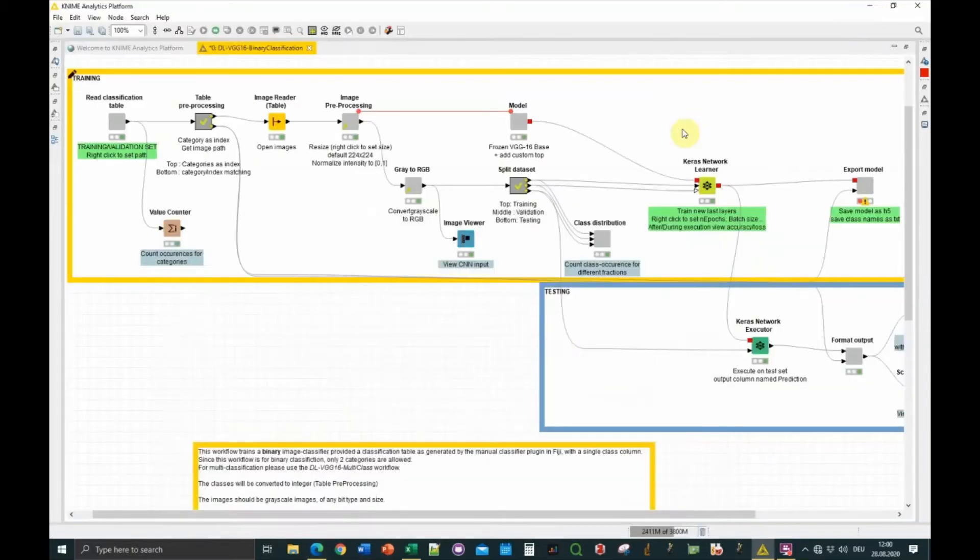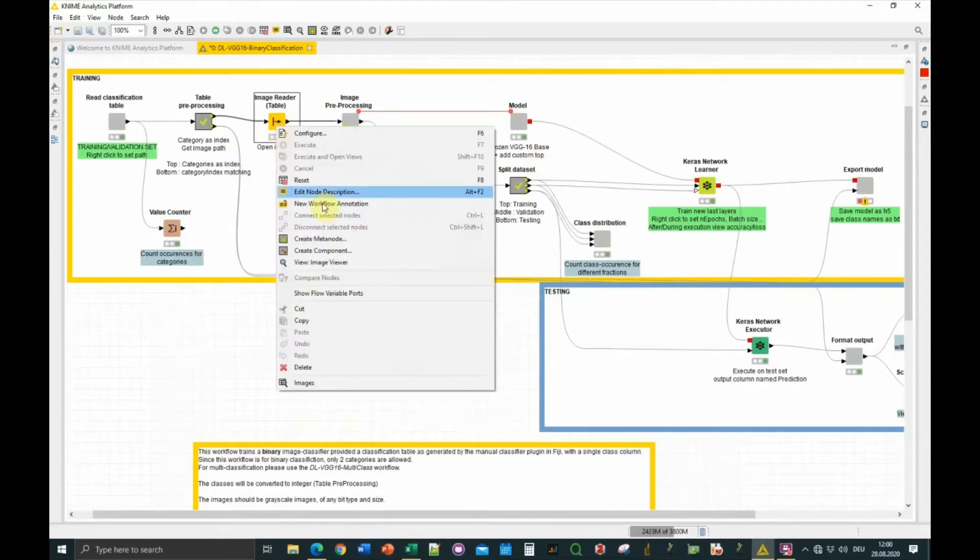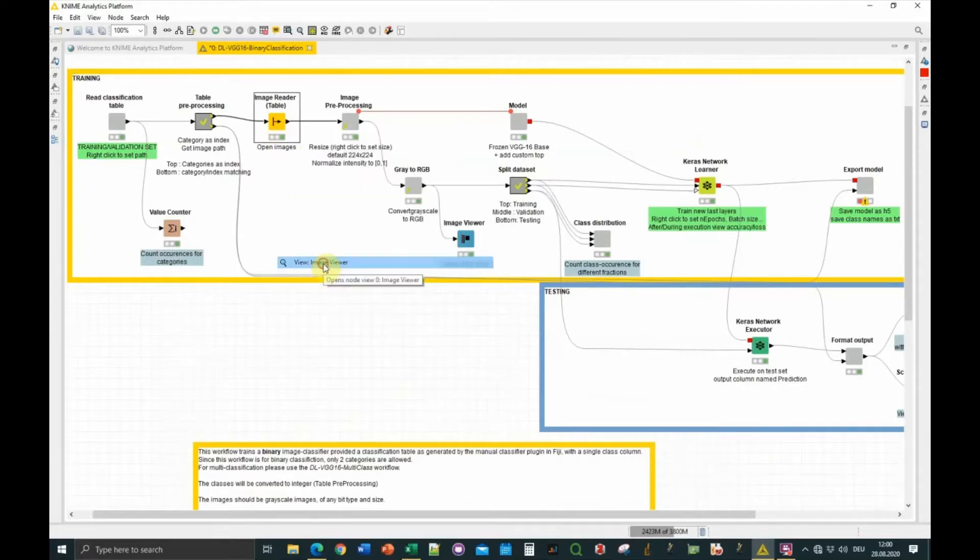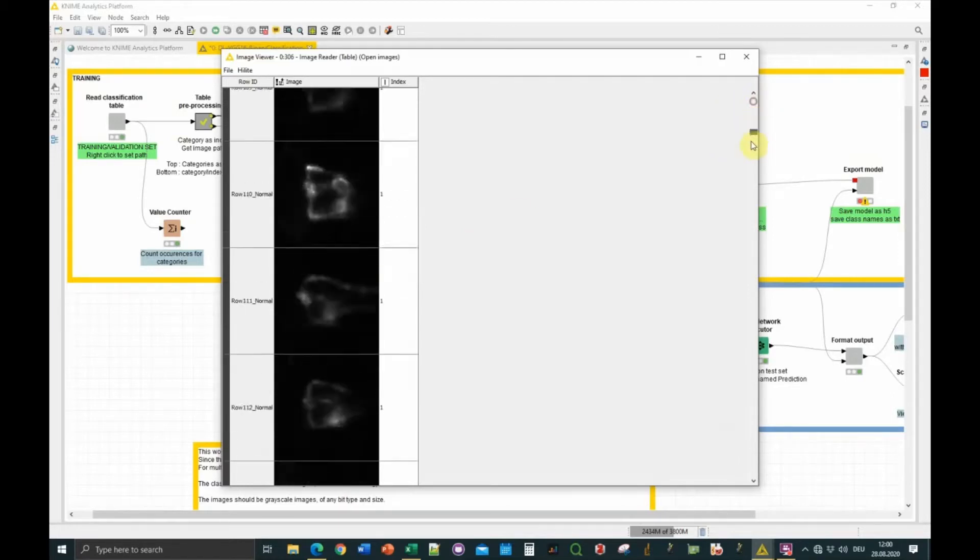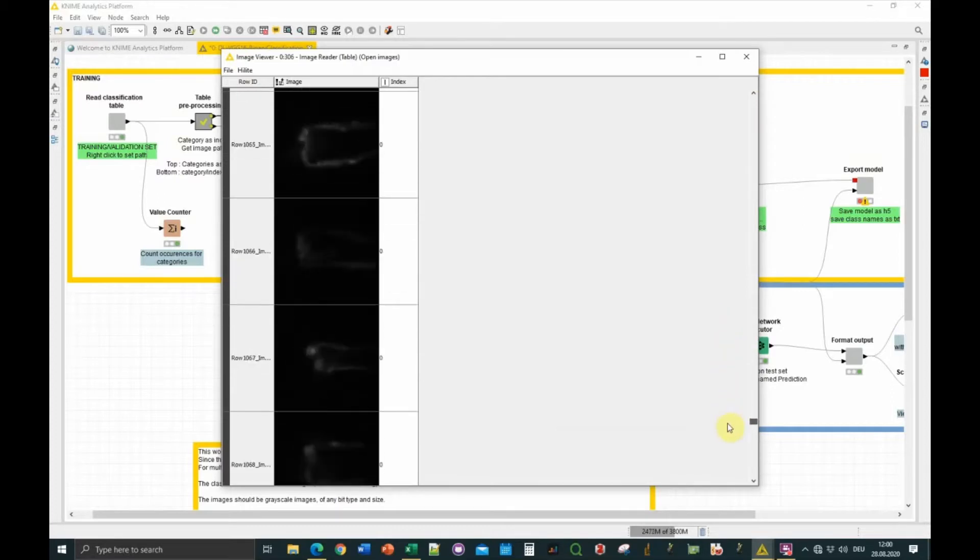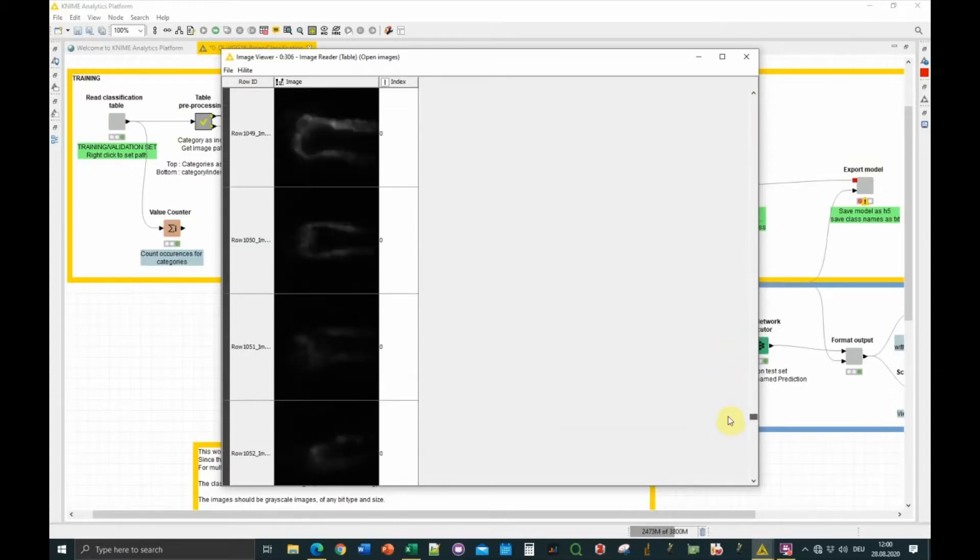The purpose is to have a model that takes an image and says this image belongs to this class or this class. This workflow is doing binary classification, meaning there are only two output classes. I'm illustrating it on some biological problem, actually some images of kidney. These are the images, and we want to recognize two morphologies: this normal morphology, and then an impaired morphology which is more like this, somewhat elongated.